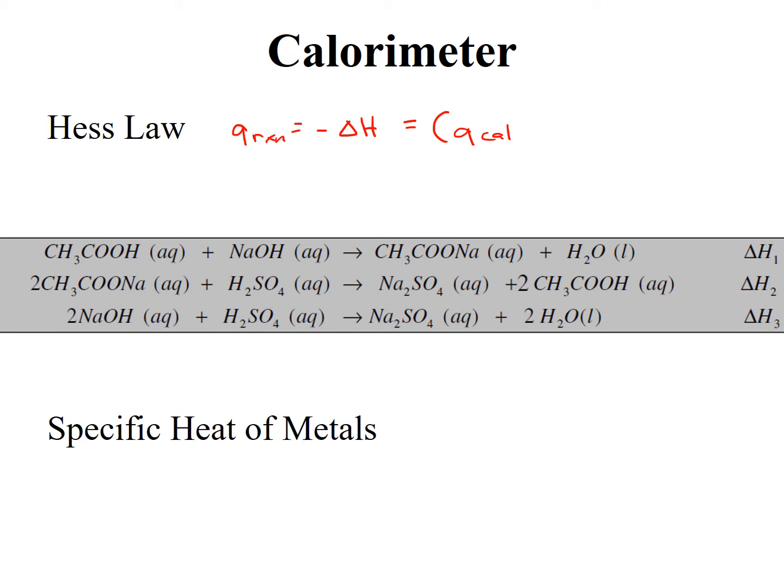And the way that we're going to look at this, it is in terms of the heat in the calorimeter plus the heat capacity of the calorimeter. So knowing the heat capacity of the calorimeter, which we determine in the first part, and measuring the mass of the calorimeter content and the temperature change allow us to calculate heat of reaction and enthalpy. Okay?